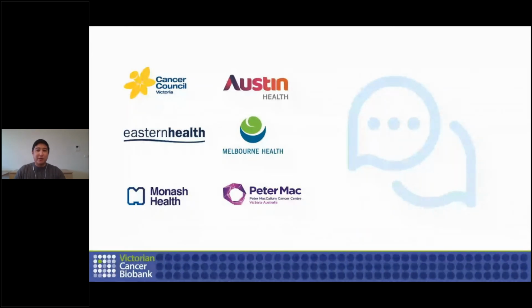Yeah, well, we currently do this biannually and annually, but we haven't used the scheduled jobs to perform it every 6 months or 12 months. It's manual at this stage, and we use external software to manipulate it afterwards. Right. So if it's once in 6 months or so, then doing it manually is not much overhead.